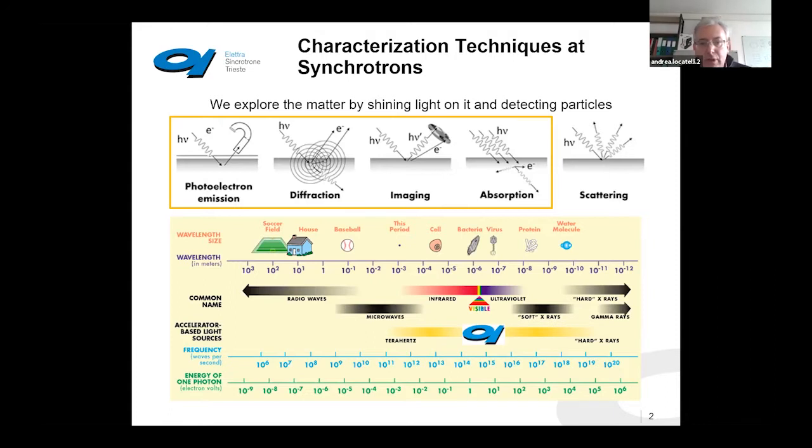They come here to perform a number of experiments which are approved by independent panels from Elettra and from CERIC, and they basically use radiation in a very broad spectral range, which goes from the infrared to the hard X-rays, through the ultraviolet, and especially soft X-rays, as a ring which can operate at 2 and 2.4 GeV. Elettra is particularly suited to produce soft X-rays.